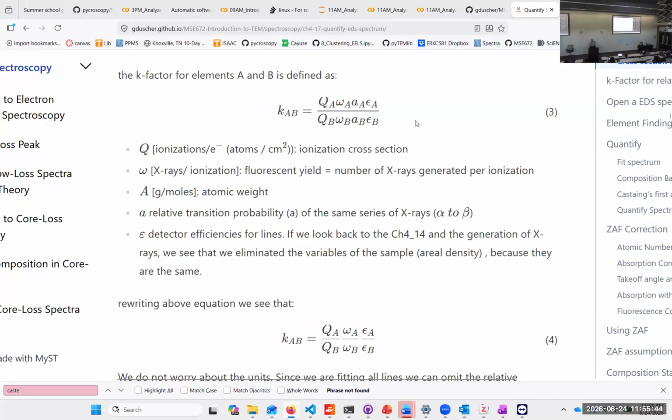And then you have to be in an SEM much more careful, because topography can get you, right? So we need to know the path within the sample. If you have a big mountain between where you generate the photons and where the detector is, then obviously you will have a lot of absorption there. So sample geometry and the quantification.